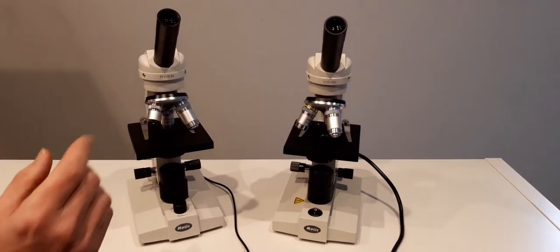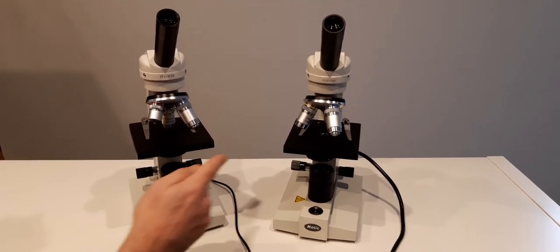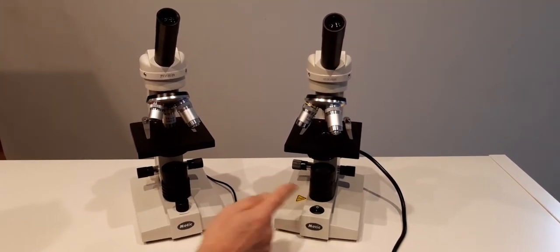So today we're looking at the Motic SFC 100 LED and the Tungsten version microscope.